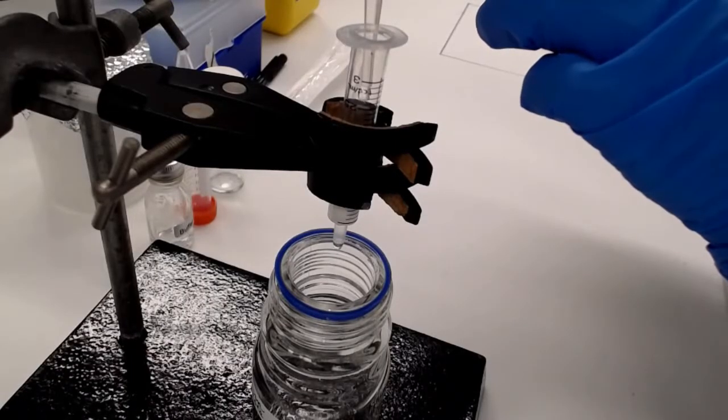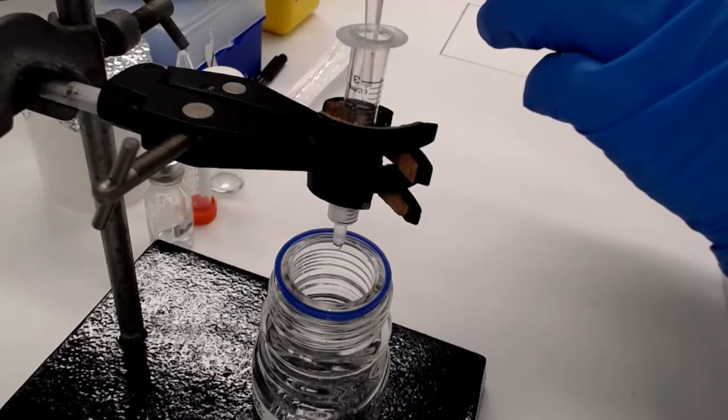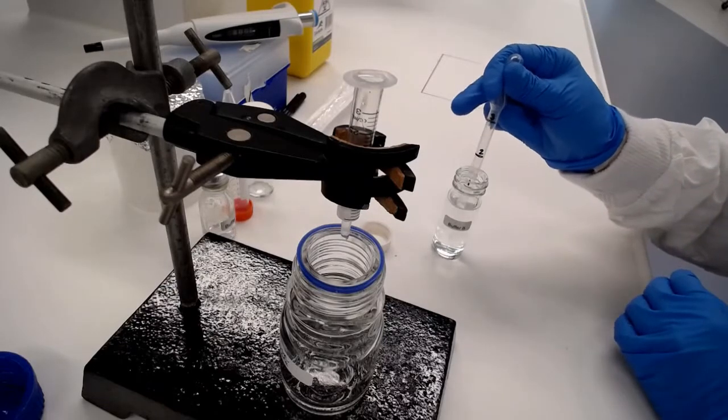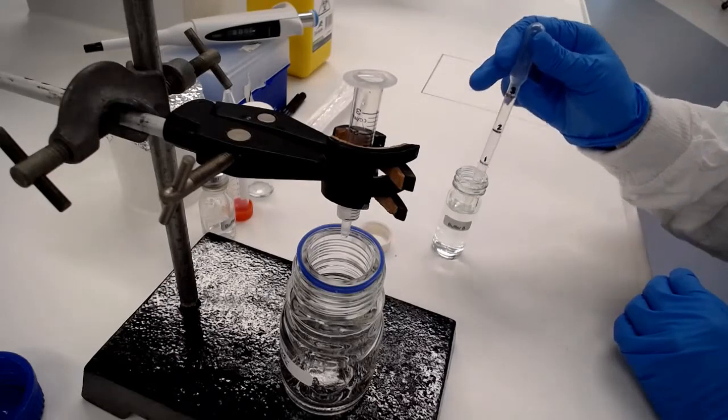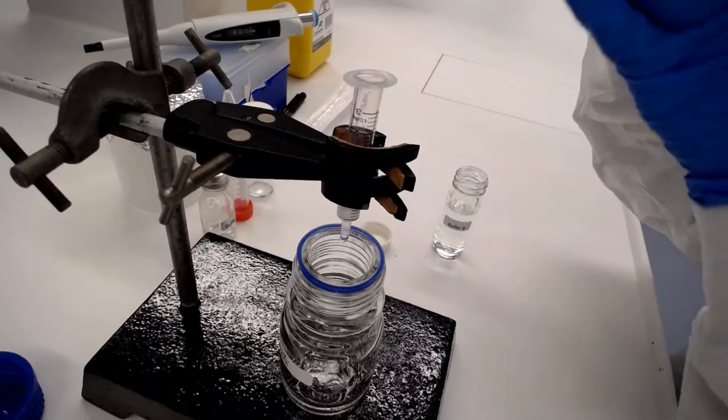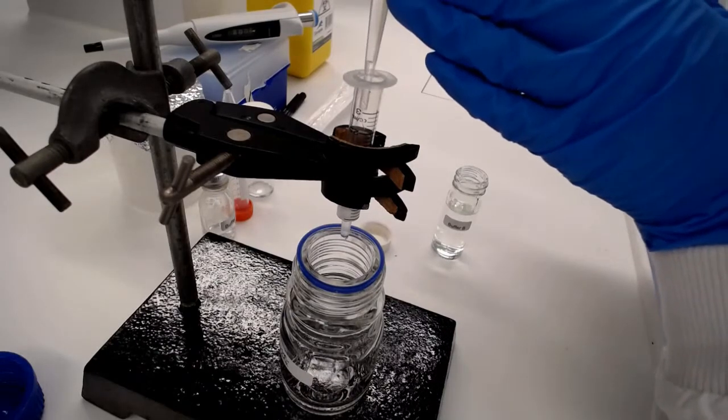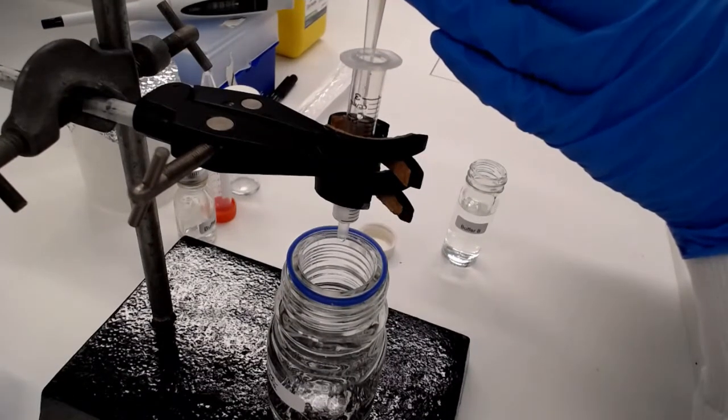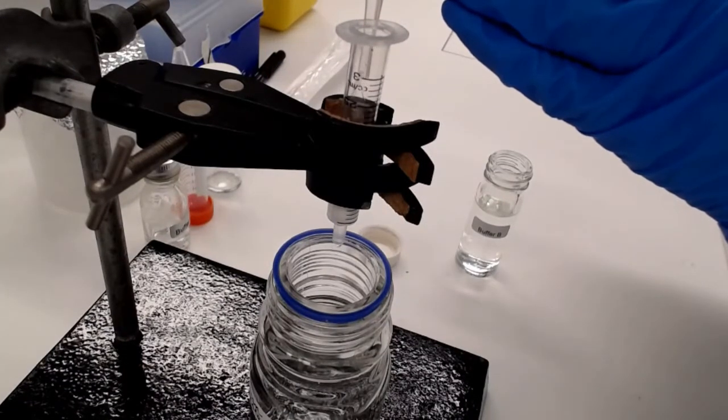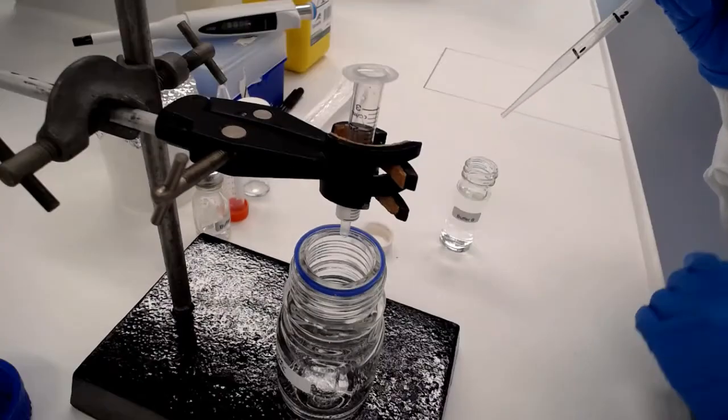We've got three mils of buffer B there. We're going to now slowly add that to our column and the key here is slowly and gently, carefully. What you don't want to do is squirt the buffer in really hard because that'll disrupt the bed of nickel agarose and the procedure won't work.